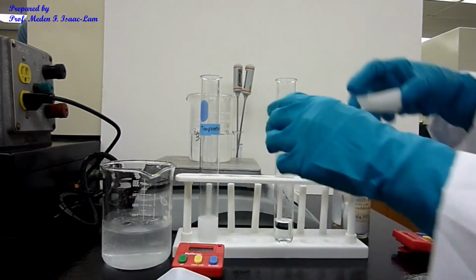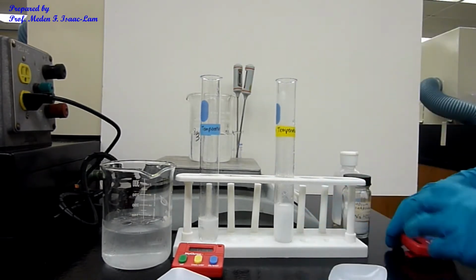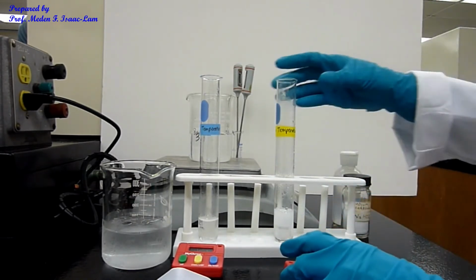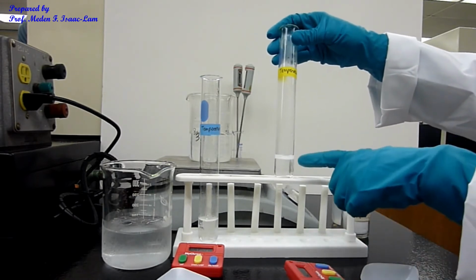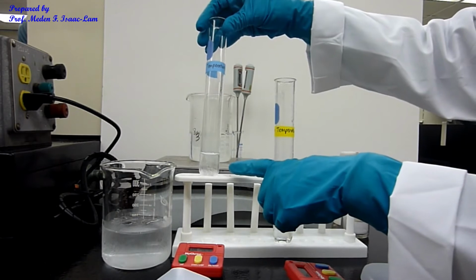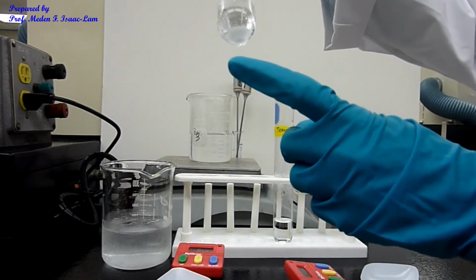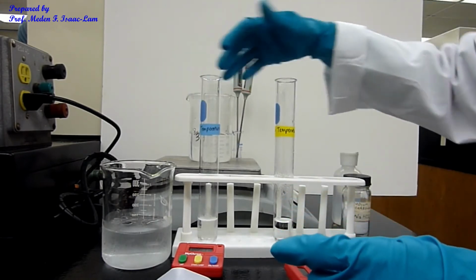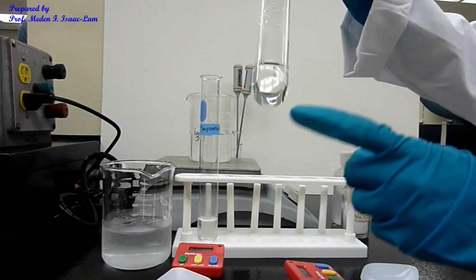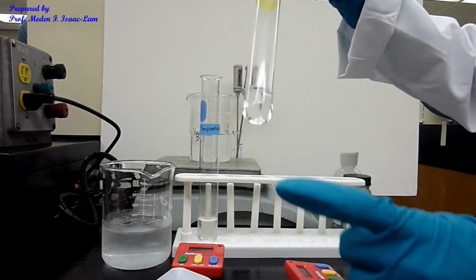And then the higher one, so set the timer. So there's a lot of bubbles in the high temperature, while this one not a lot. You can still see, but it's slower. It's still reacting. However, this one is done. There's still a little bit at the bottom, but it's done.